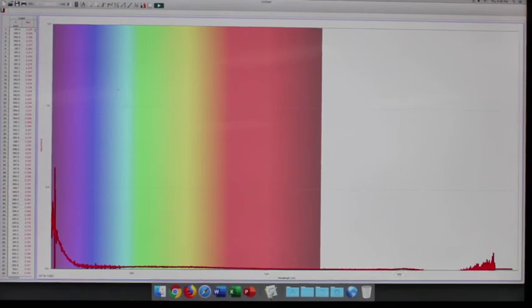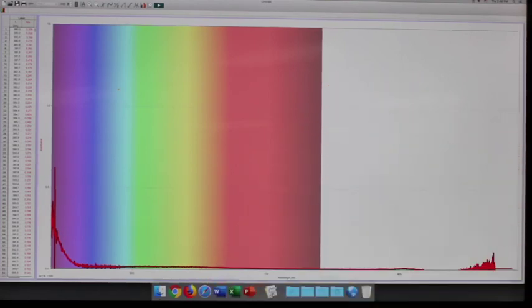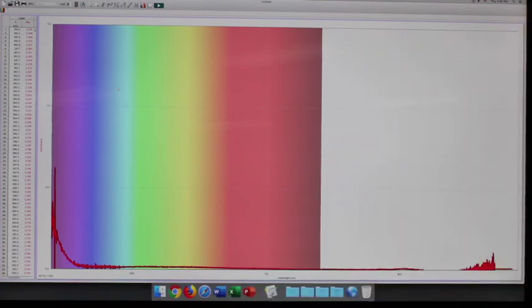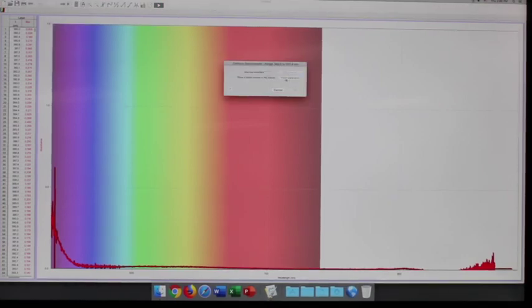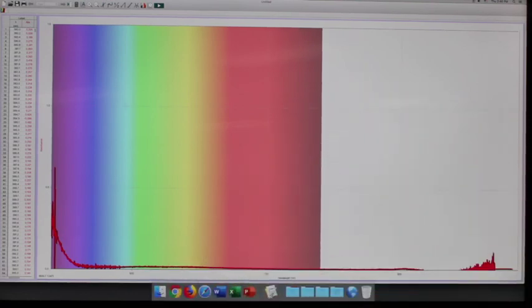Okay, now I'm going to take this experimental DI out and switch it with our blank ethanol. Put our blank ethanol in, go up here and hit experiment and calibrate. We're going to recalibrate it now with ethanol. Skip the warm-up, finish the calibration as we did before. Then I'm going to press OK. I'm going to take my blank out and put in my experimental ethanol, which is my onions and ethanol solution.